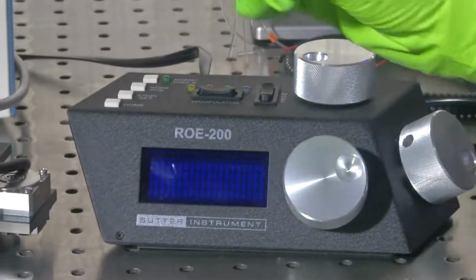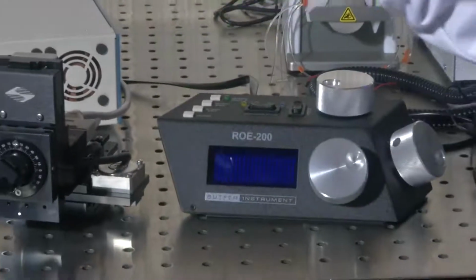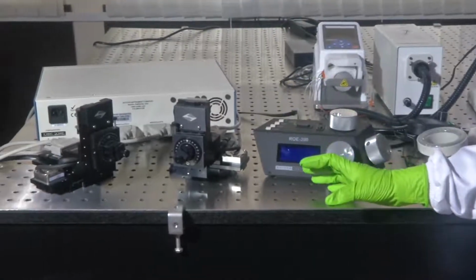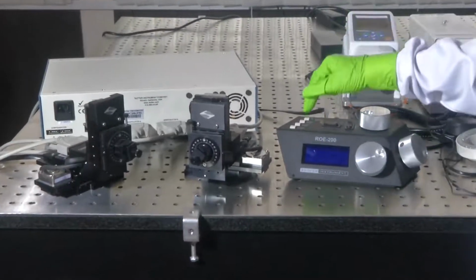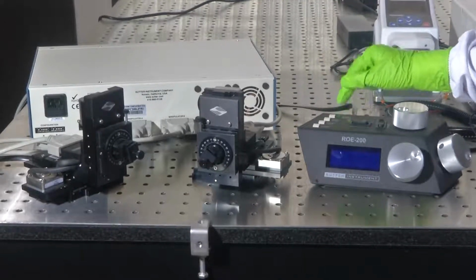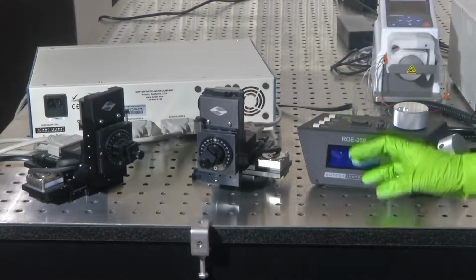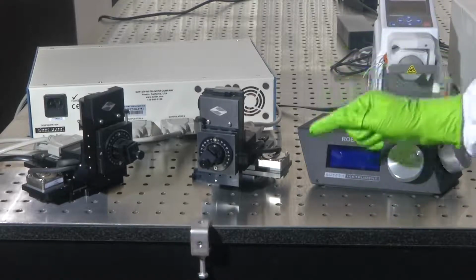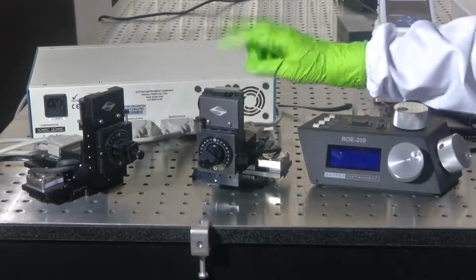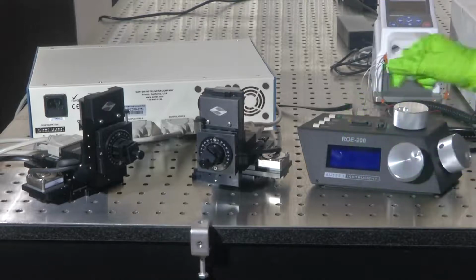Say you have used the device and you have a test sample, and then you have indented at some x, y and z position. You could always save that x, y, z position using this option, work position. It saves the values of x, y and z, and you could go back to your home position, which is nothing but 0, 0, 0 on the x, y and z scale, and always return back to your previous work position.